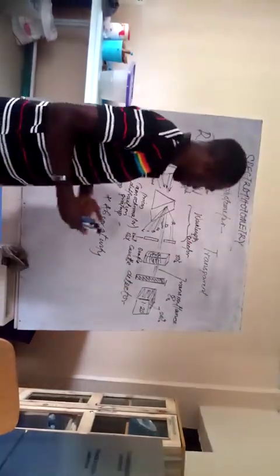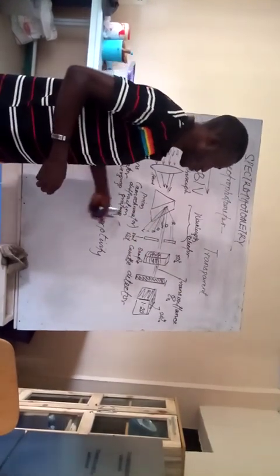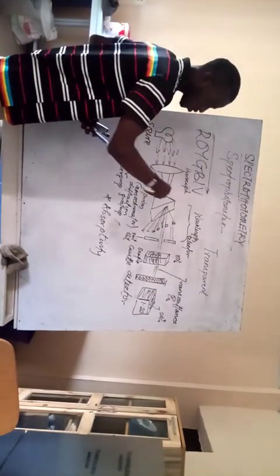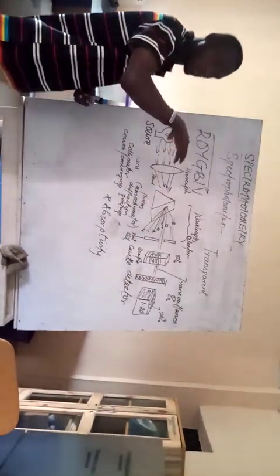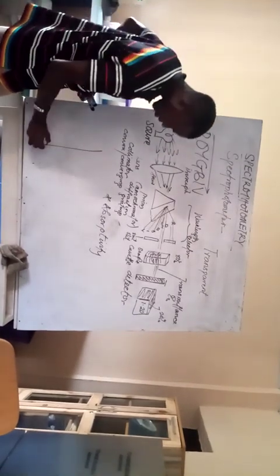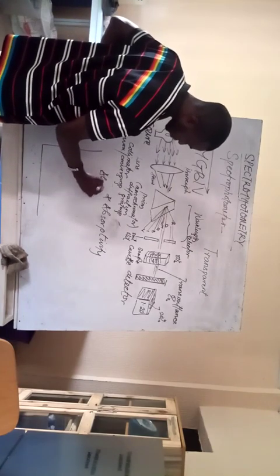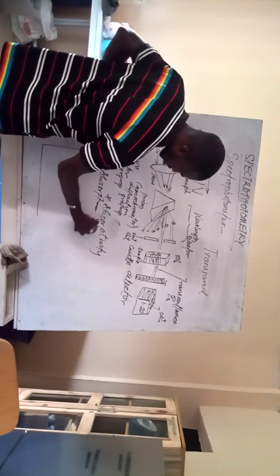Now, to work with these values, we set the monochromator at different wavelengths to find the particular wavelength of light at which this sample can absorb light the most. So we now plot what is called the absorptivity spectrum, or absorption spectrum.